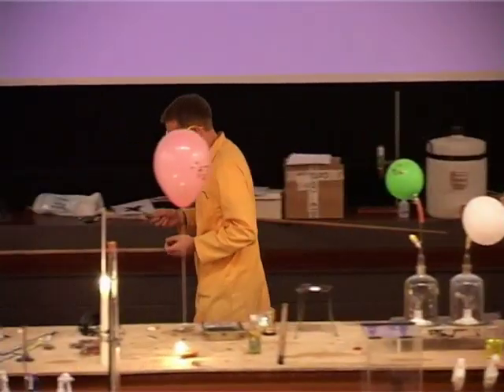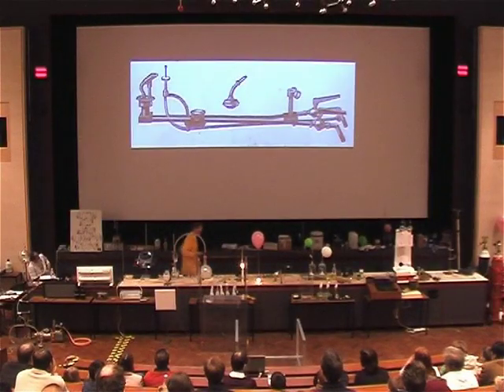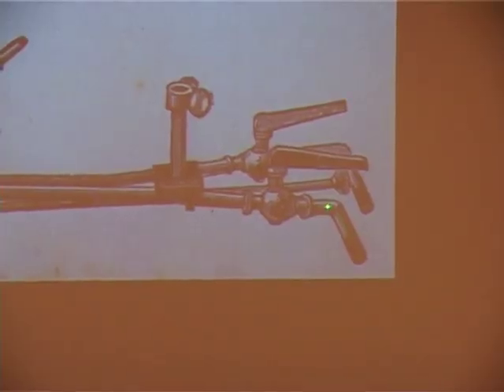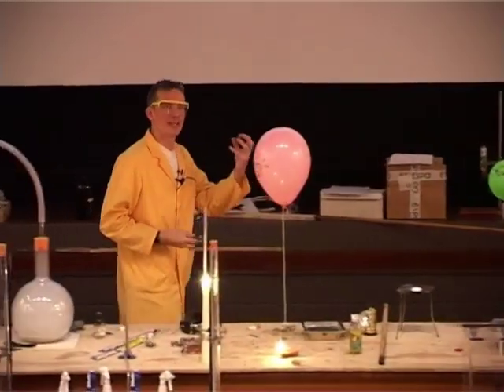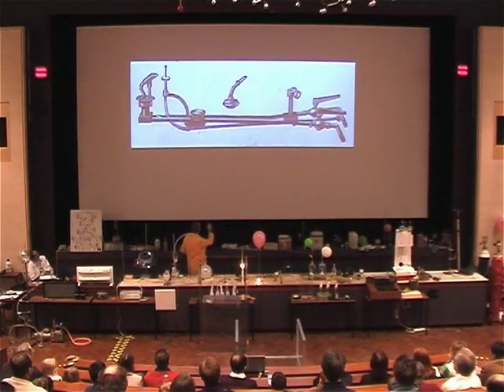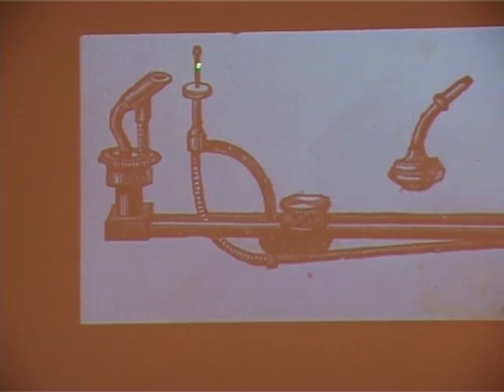Well, how exactly did they do it? Well, this is the sort of apparatus that they used. Similar to ours, there are the taps here with the hydrogen and the oxygen coming in. We need hydrogen and oxygen because we need a really, really hot flame in order to excite the calcium oxide sufficiently. So the gases come in here and then come out of a little jet here and play on the calcium oxide, or the lime.